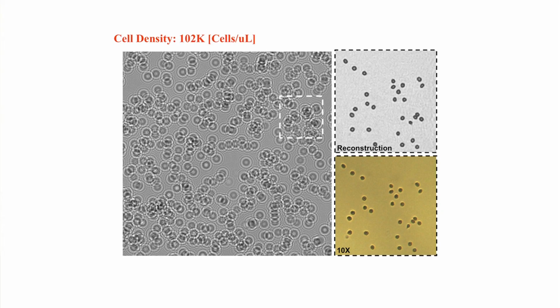And take an image like this and reconstruct it using Fourier optics principles to get back to the plane of the cells. These are red blood cells, as if you have a regular microscope looking through an eyepiece or looking through an objective lens. So you can get the same performance without the lens entirely through computation.